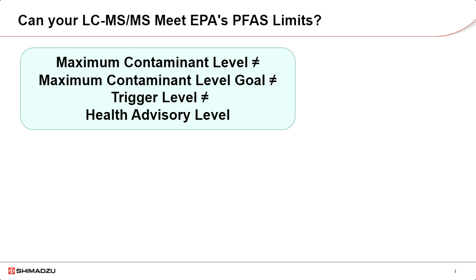Well, there is no straight answer to that question, because when someone asks about PFAS limits without specifying which one, I cannot tell you if the LC-MS is going to be suitable to give you the concentrations that you need to achieve.